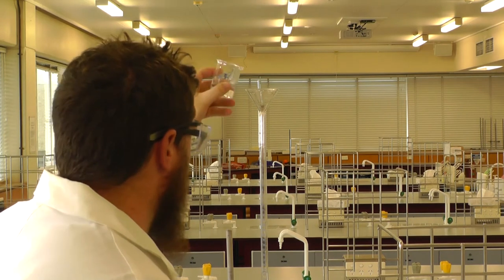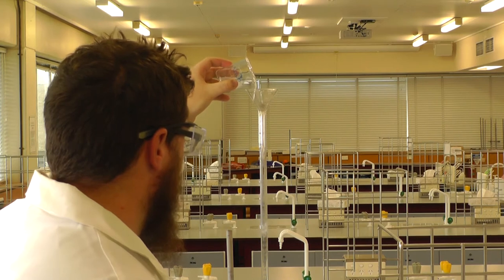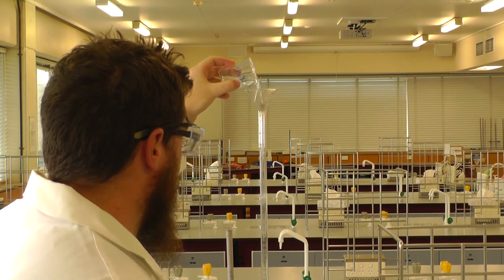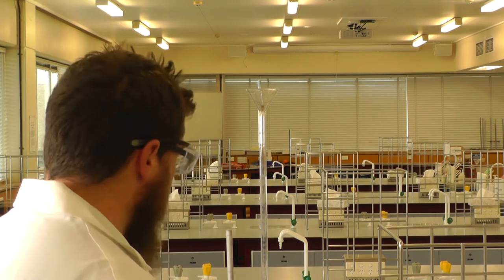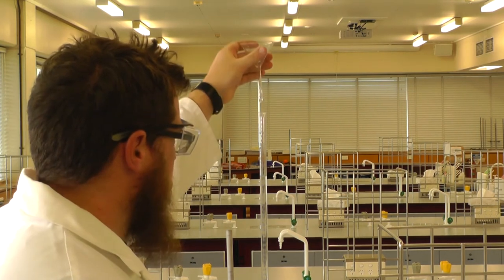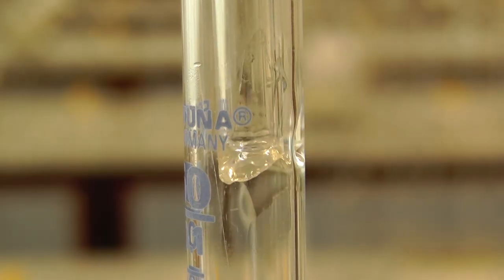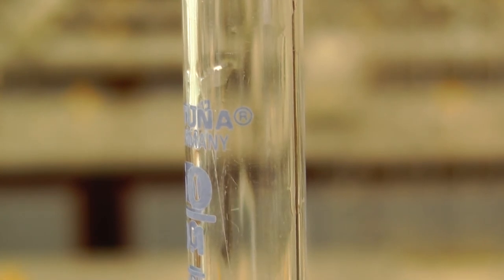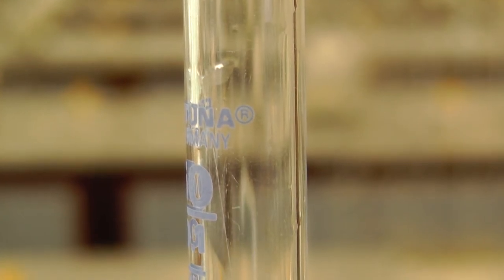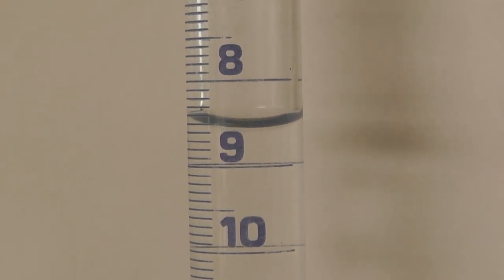It's not necessary to fill the burette to a specific point as long as there is enough solution to carry out a titration. Remove the funnel. There may be some drops of solution in the funnel which could fall and interfere with your results, as these few drops can significantly change the reading on your burette.